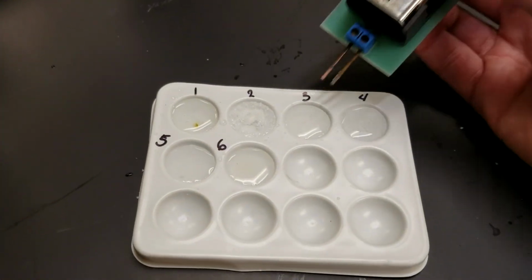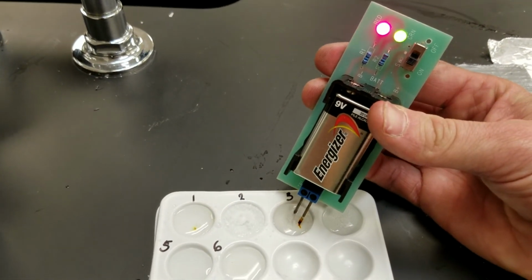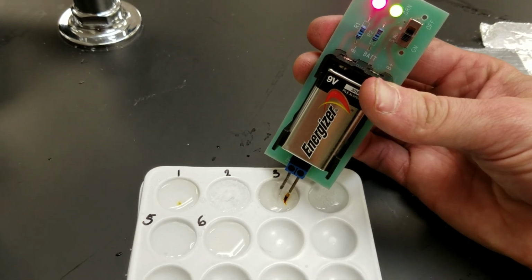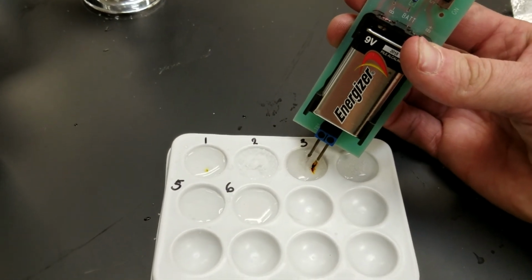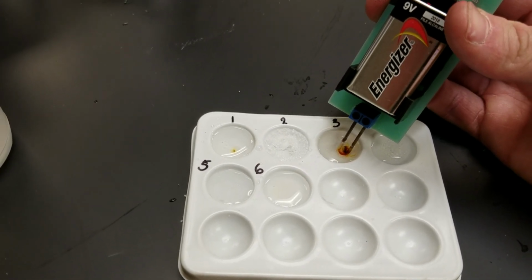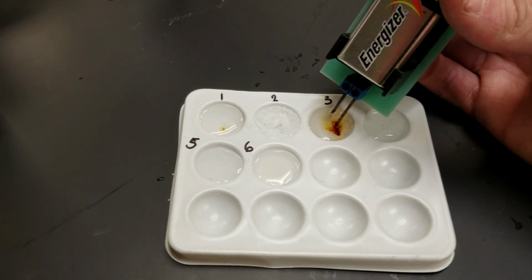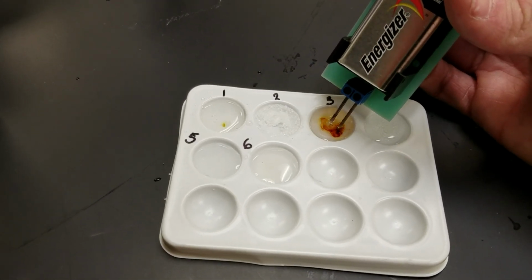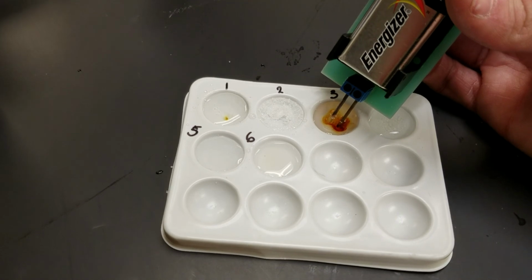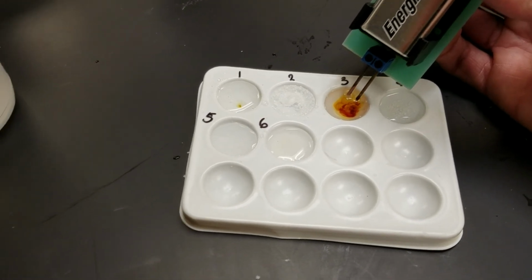I'll go to potassium iodide now, number 3. Very bright on number 3. So potassium iodide has a high conductivity. And on top of that, when I stick this conductivity tester, which is sending a small electrical current through, I'm seeing a change in color within the solution that wasn't there before. So that's definitely something worth noting.